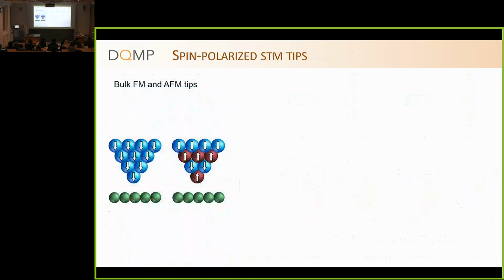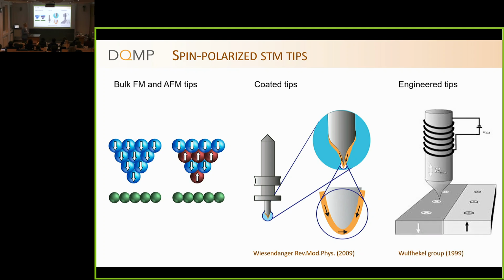And so people have tried to develop techniques to actually be able to extract the magnetic moment, and that they do by taking a soft magnet material, putting a coil around, and then oscillating the current in the coil to induce an oscillating field in the tip. And this way, this is probably very difficult. It's been attempted many years ago, but this has not become a mainstream way of doing STM. So I guess this remains quite difficult. But the challenge to have really a technique to extract the spin component independent of topography is still something that remains to be done.